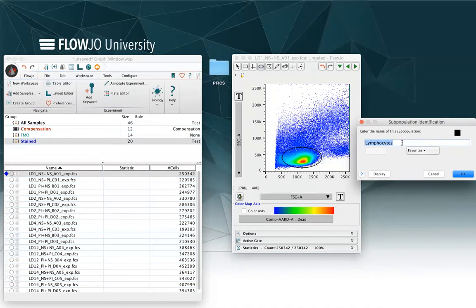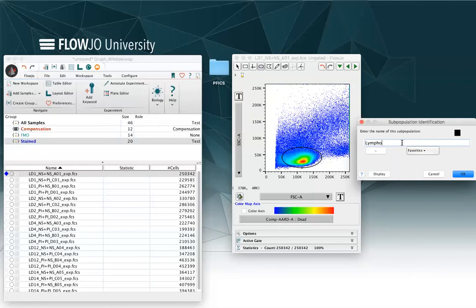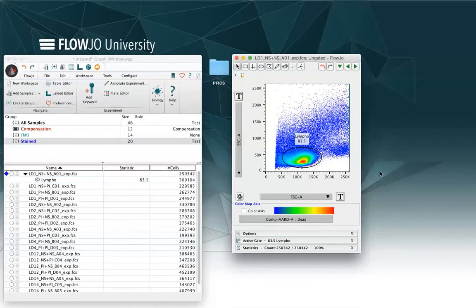Otherwise, you can delete what's inside the field and type in any other name. You can add it to favorites or you can remove it if the name of the gate is a name that you don't use that often. I can click on OK, and then I can eventually adjust my gate and move it around.